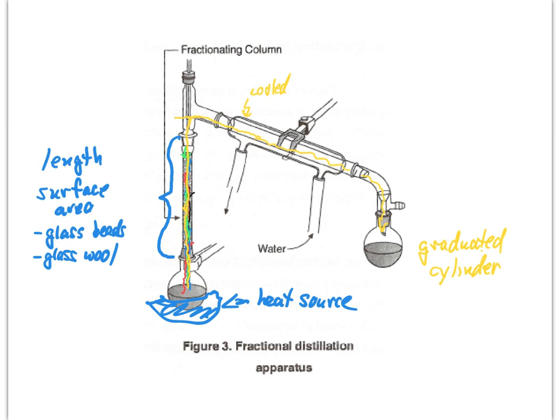And so we got a couple of things here, right? The longer our column is, or the more surface area our column has, we get more theoretical plates.